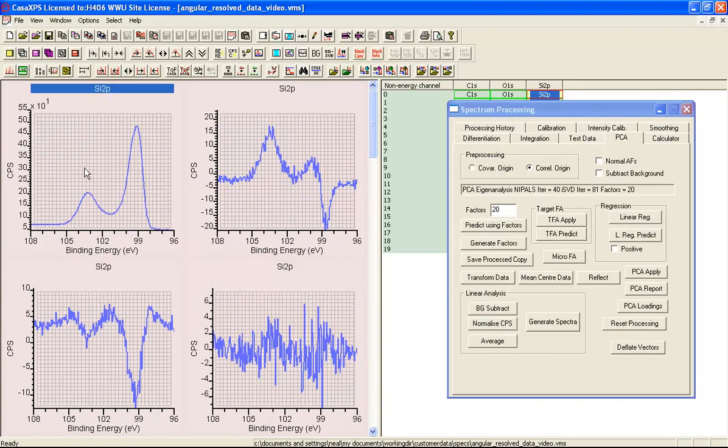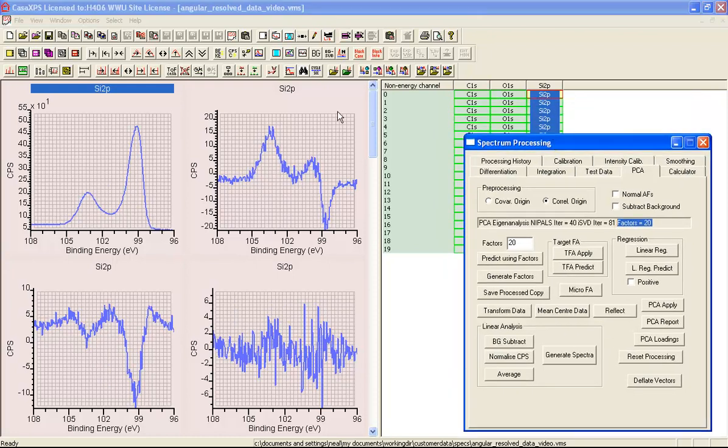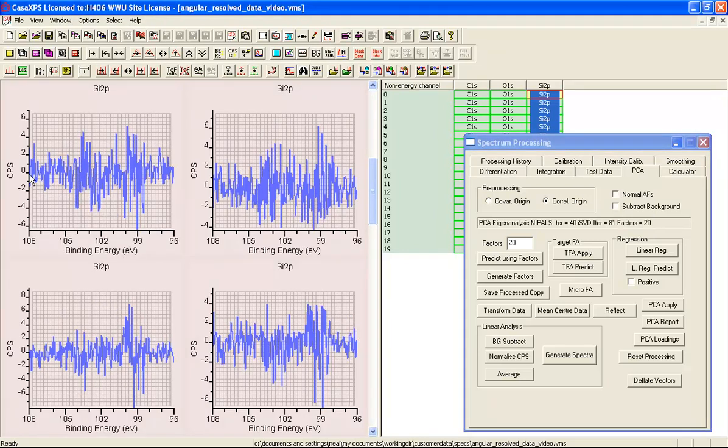And you can see this is the first abstract factor. This corresponds to the top block here, and it looks very much like this average spectrum. It's not quite the average spectrum, but it looks very close to it. And then we have a sequence of abstract factors that have various shape information that look consistent with the peaks that you might find in the data. And then the fourth one, we've got a very subtle variation, and the fifth one, this is the one that was determined to look more like Poisson noise.